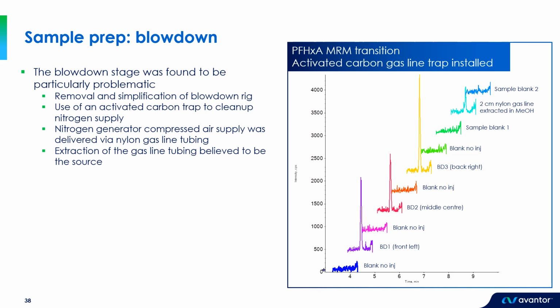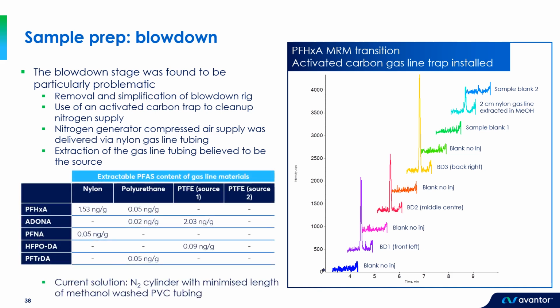We also assessed a number of other tubings manufactured from different materials, so polyurethane and two sources of PTFE, and surprisingly, we actually found that the PTFE tubing was the cleanest, but we clearly didn't want to go down that route.